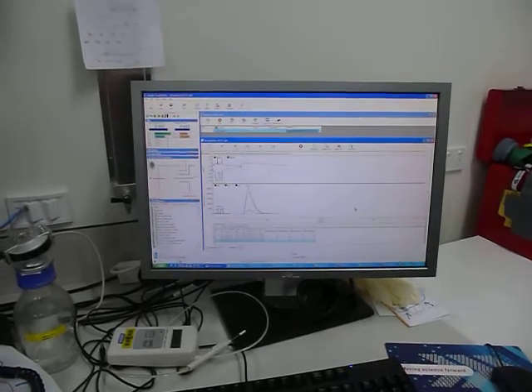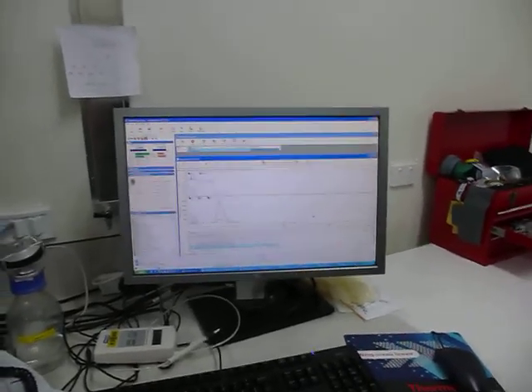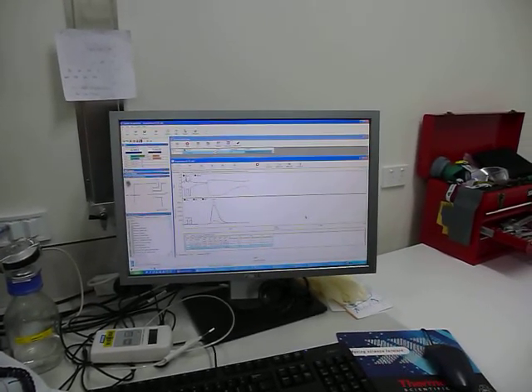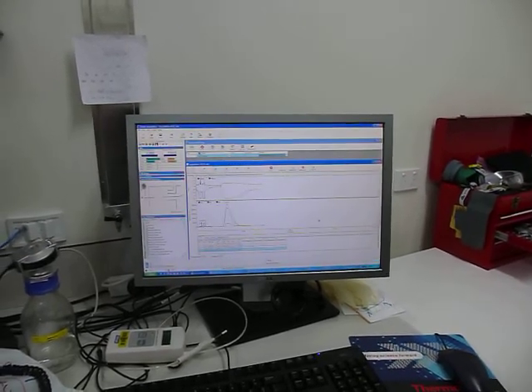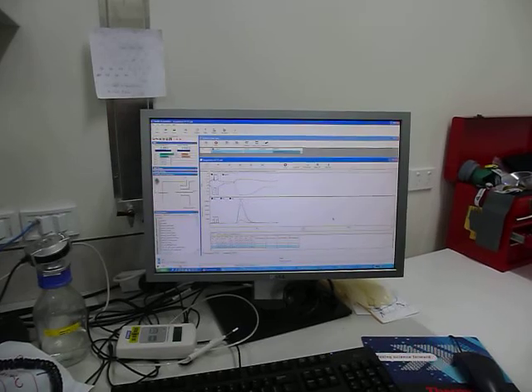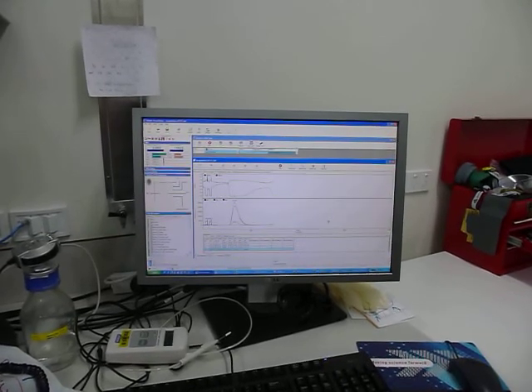And my point here is also that I can use the robotic arm with any kind of device. Here I adapted it for liquid sampling in these TOC analyzers. The Shimadzu also does total nitrogen. TOC is total organic carbon. So here it's being adapted to measure organic and inorganic carbon. Not only the concentrations but also the isotopes, because it's also coupled to the stable isotope mass spectrometer.